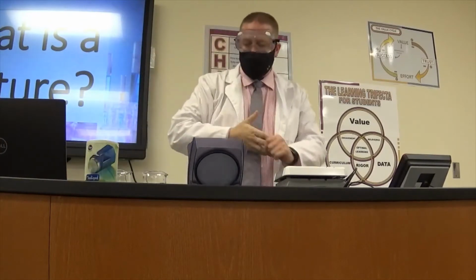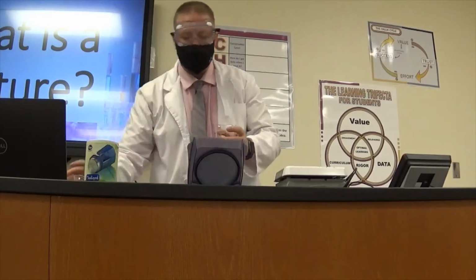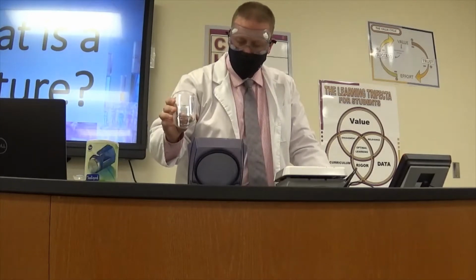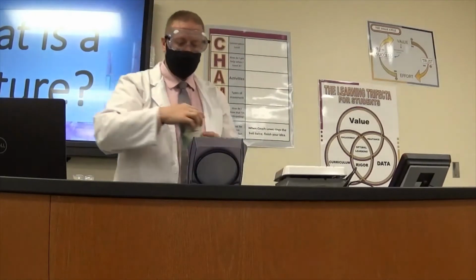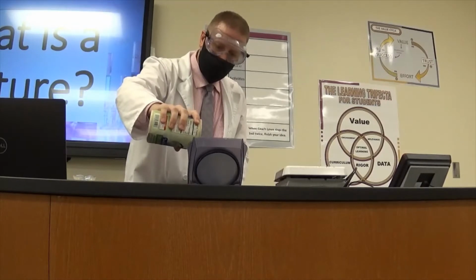So, we'll start off with, I turn on the scale, and I'm going to find the mass of this beaker. So the mass of the beaker just by itself is 111.32. And I'm going to measure out 3 grams of salt.